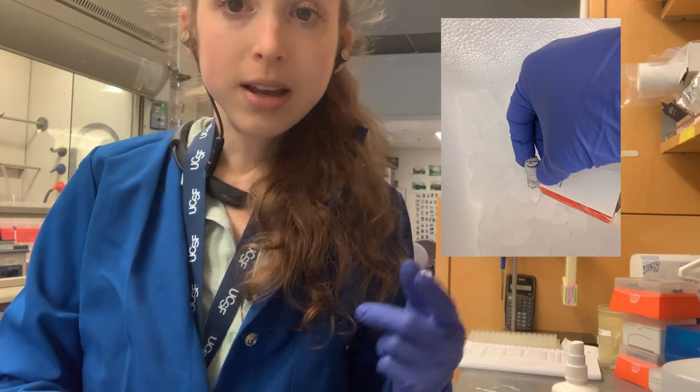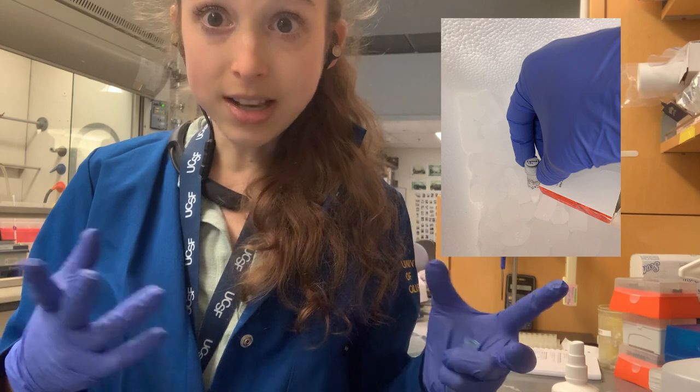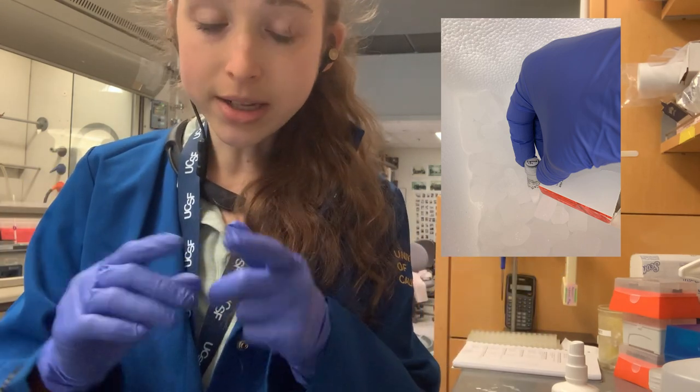And sometimes the tubes don't even have an expiration date. The other day I was like, how old is this enzyme? I have no idea. But back to the main story.